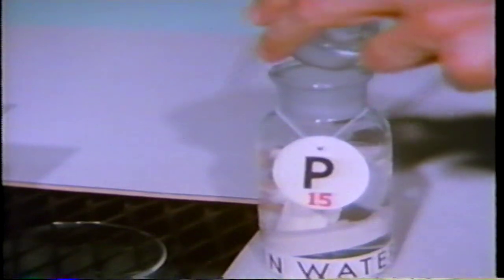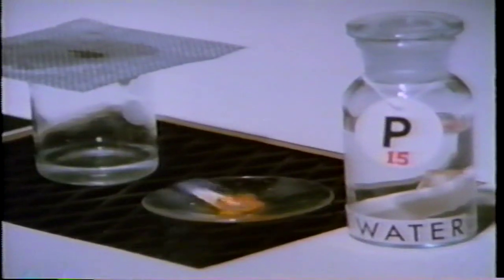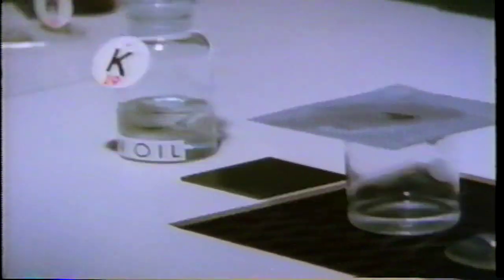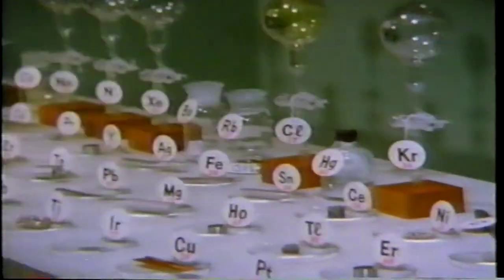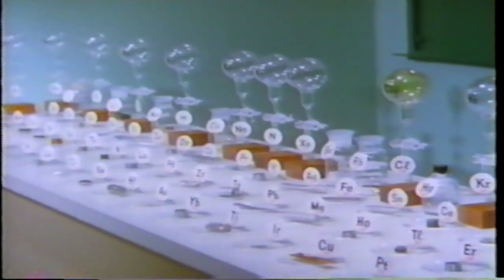By contrast, the element phosphorus is stored under water, but it too reacts rapidly with air. Phosphorus and potassium are similar in reacting with air, but they differ in appearance and in their behavior toward water. Here are most of the some 100 known elements. They have similarities and differences in appearance.